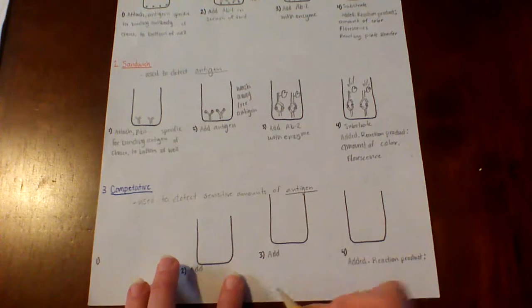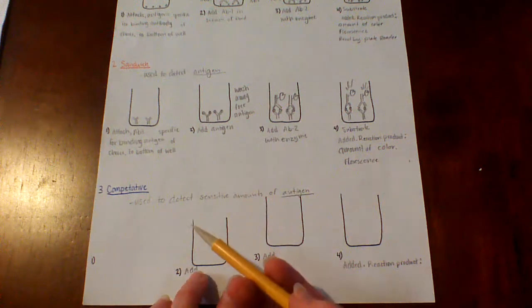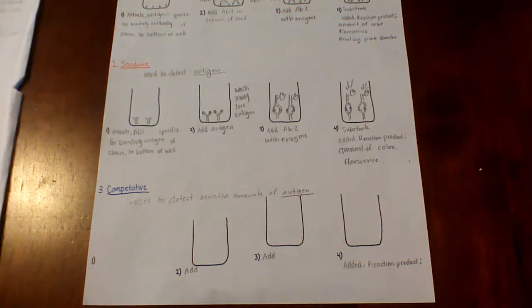So where the sandwich method can say if there's antigen in the serum, the competitive you can find the specific concentration of antigens. And the competitive is inhibition.